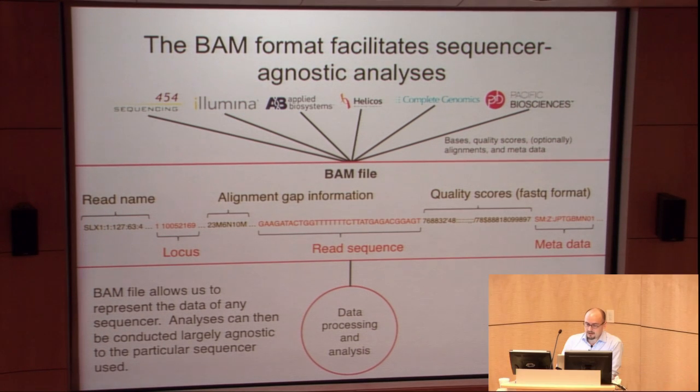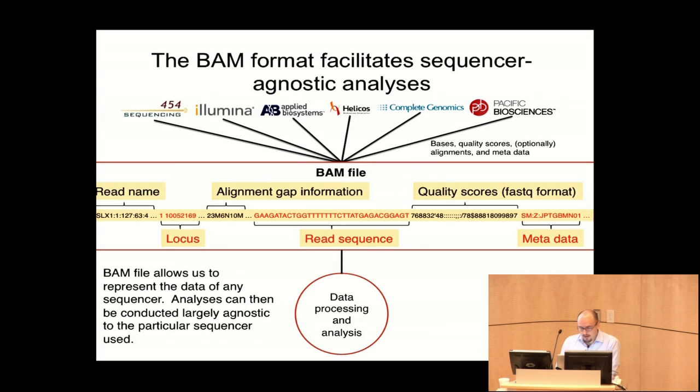So just a plug here on BAM format. I couldn't recommend more strongly that if you have next-gen sequencing data, you get it into BAM format. The Broad already is using this extensively. This is more for reference for people.